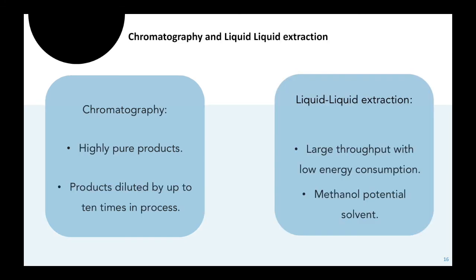Chromatography. In similar compounds to DHA, a strong cation exchange resin of polystyrene sulfonate has been used to separate the desired products from impurities. In laboratory models, original feed solution was diluted up to 10 times with water in the process of liquid chromatography. However, experiments demonstrated purity of products obtained as more than 95%. The main downside of liquid chromatography is the extensive dilution, and a further stage of evaporation would be required should this method be applied.